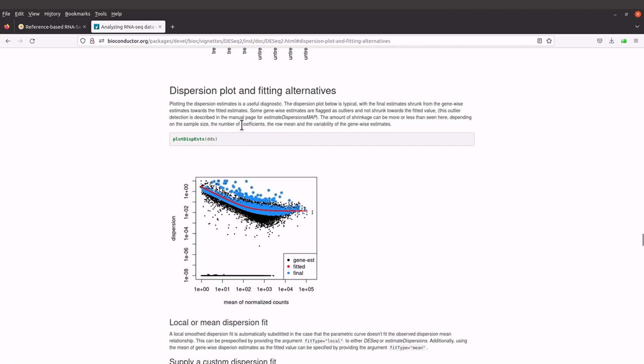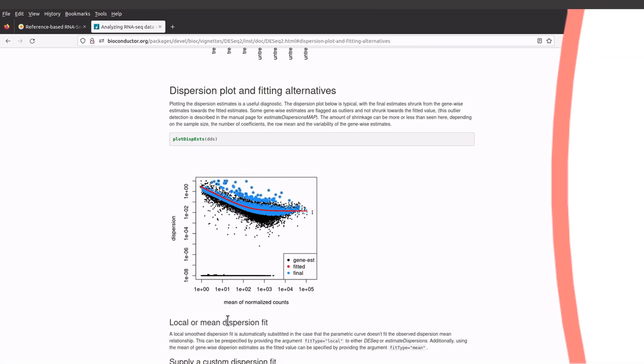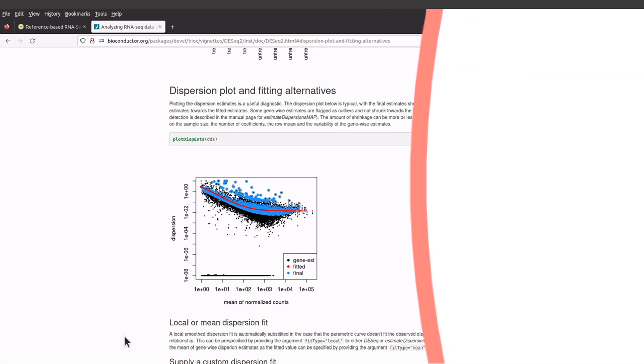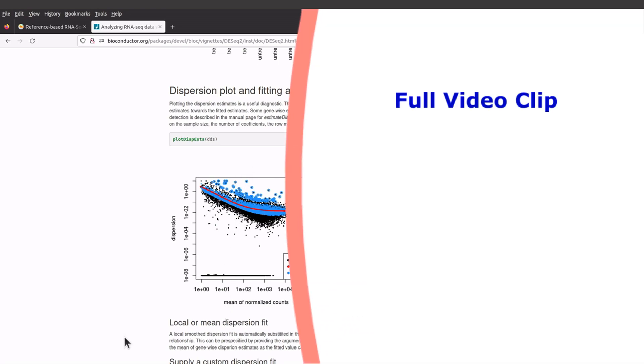This is what we have. If you compare the plots here with our plots, they are kind of similar. This tells us that our data is okay according to the dispersion plots that we have here.